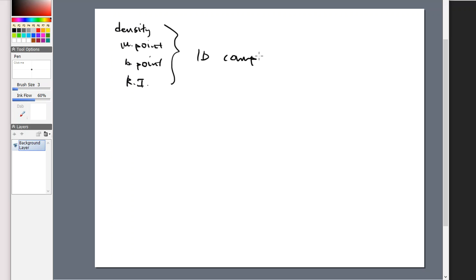And that's pretty important. That is a lot of what we do in a laboratory environment. So I've got to be comfortable with working with physical property tests and performing these tests on the things that are given to me, and then reporting those values that I find. So density, melting point, boiling point, refractive index, on and on it went.